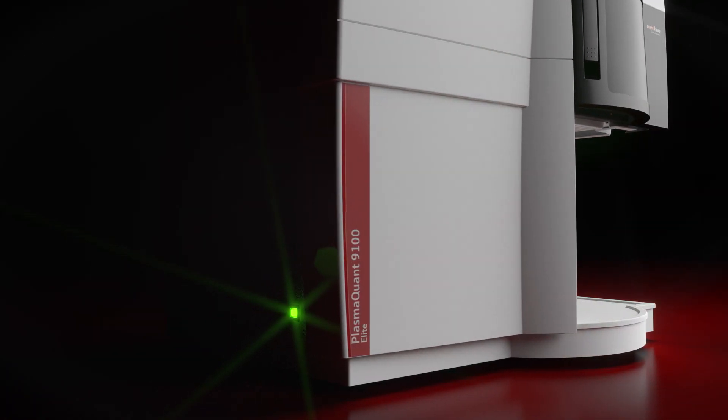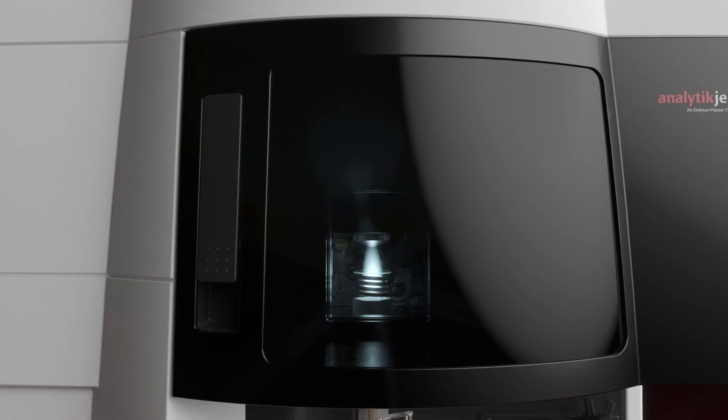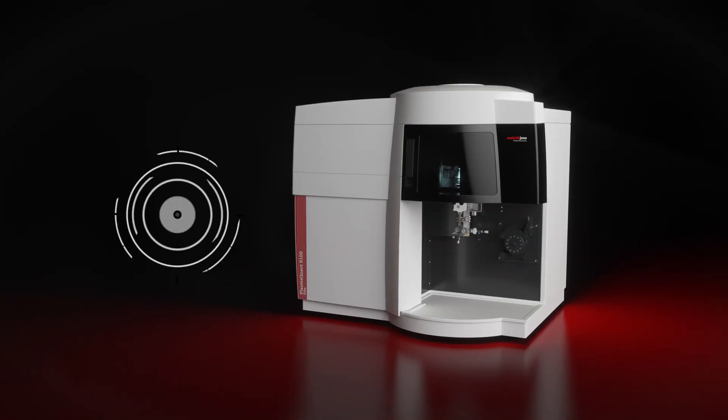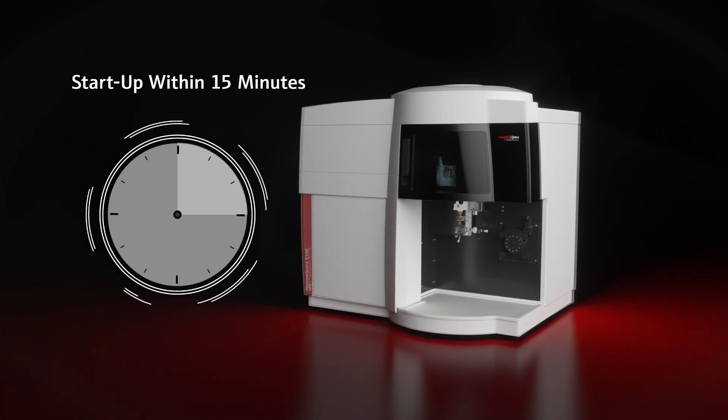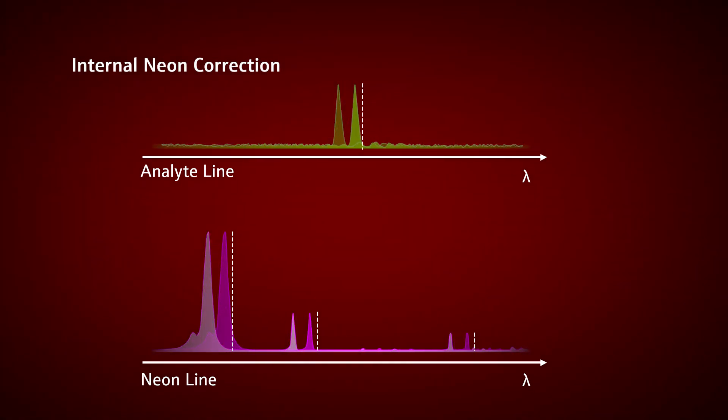The PlasmaQuant 9100 is always ready. Fast system warm-up and a self-aligning spectrometer using an internal neon correction guarantees system availability within a few minutes.